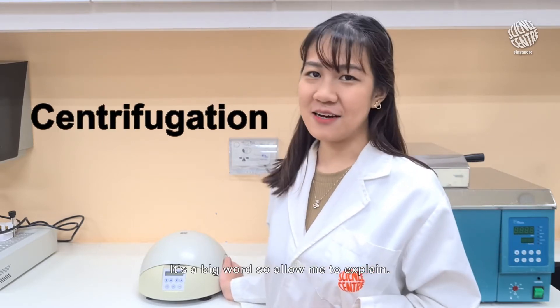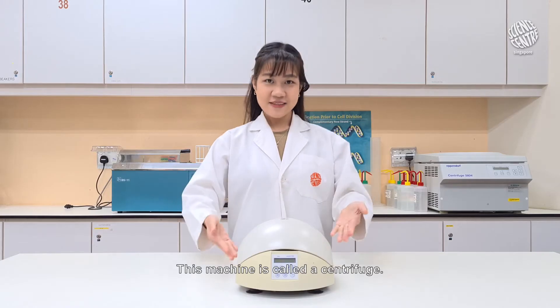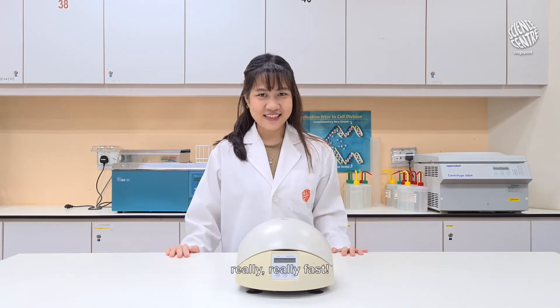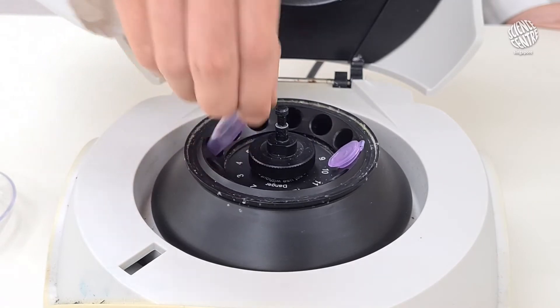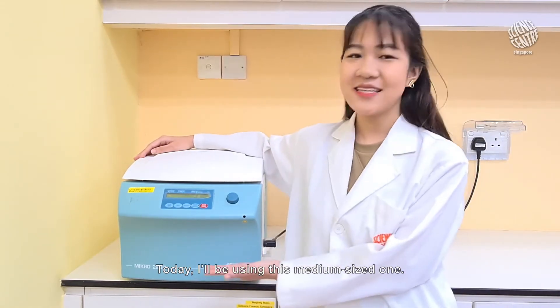It's a big word so allow me to explain. This machine is called a centrifuge. It allows us to separate mixtures by spinning them really, really fast. I have a cute little mini centrifuge for tiny samples. They can also be larger, or even larger. Today, I'll be using this medium sized one.